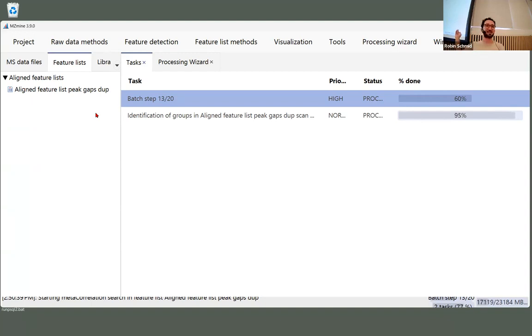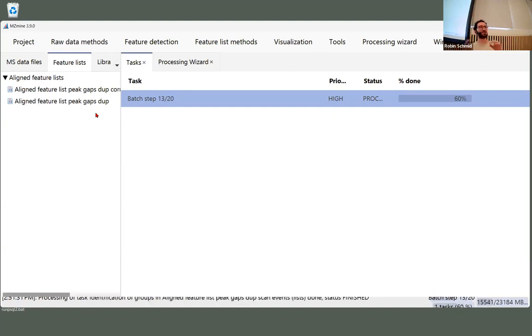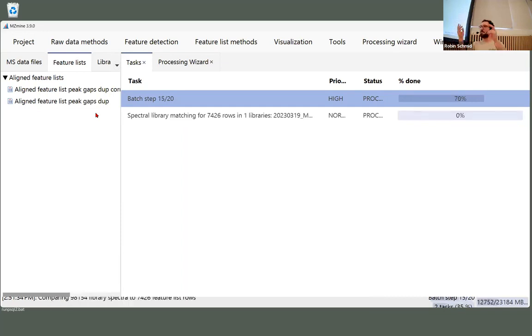But it's very hard to profile those things. Just looking into the task manager with the Java app, and I think the same might be true even for Python, is not going to show you the real memory that is consumed, because Java manages that. So there's always a garbage collector basically running and taking all those old chromatograms and old feature lists and whatever that we discard, and bringing out the trash very lazily. Only if we really need to, it's going to bring out the trash.